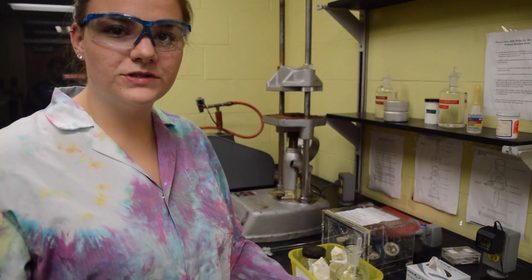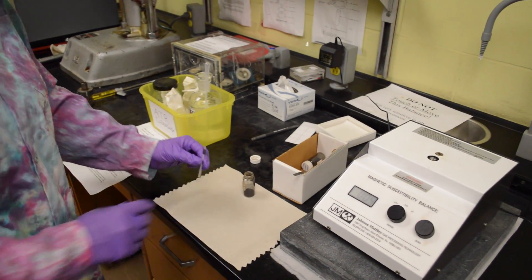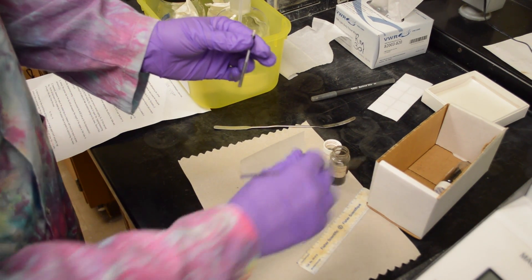Put your sample in the pre-weighed tube and tap it on the counter until it is compact. To put the compound in the tube, there are two methods that you can use.